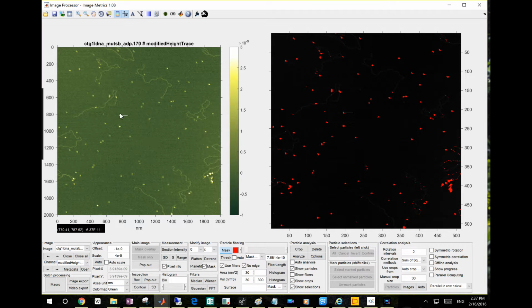But if you do want to take care of even that one, you have to use some kind of filter. We have several ways. And you can also use auto mask. If you check this box, the mask will automatically be optimized for you. You may not like it, but you may want to fine-tune the mask. If you want to quickly mask most of the useful particles, you can just click auto mask, and then you can fine-tune this procedure. So that's what auto mask means.